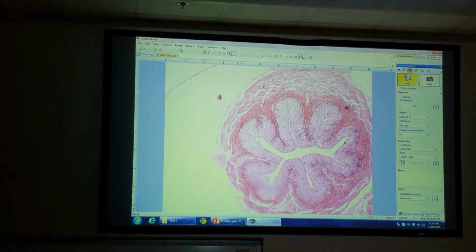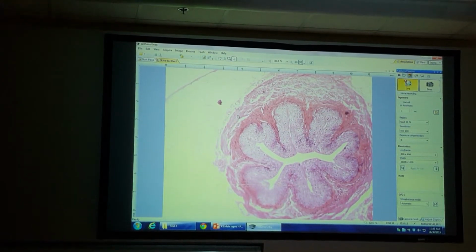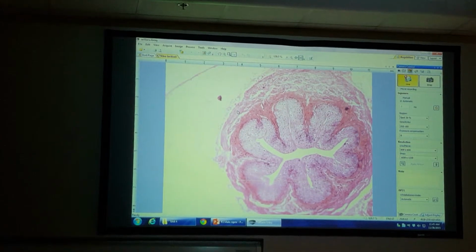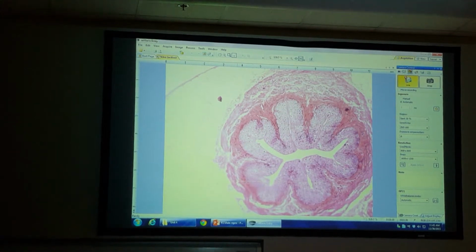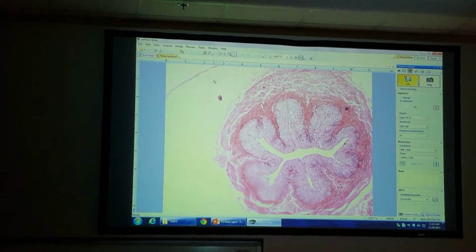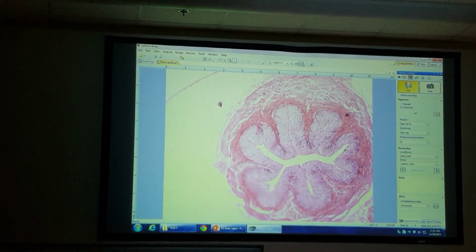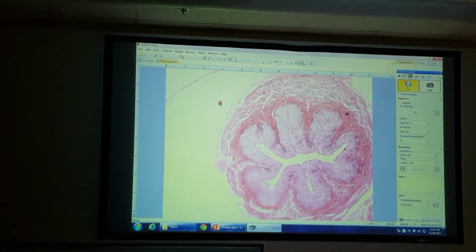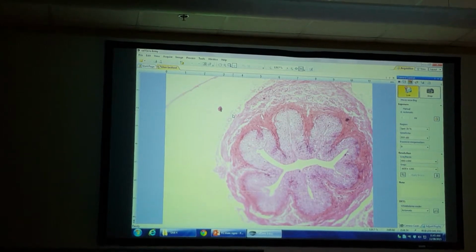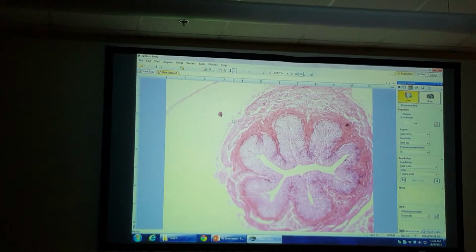Muscularis layer. Notice how thin the muscularis layer is? It doesn't need to be thick. Gravity does most of the work of draining the fluid down this ureter. Doesn't need a lot of muscular contraction. And then what am I seeing out here? Adventitia and adipose tissue. So again, transitional epithelium, lamina propria, kind of in this orangish color, the second layer. Muscularis layer, adventitia out here. Again, the organ, the ureter. Everybody good on that one? Alright.